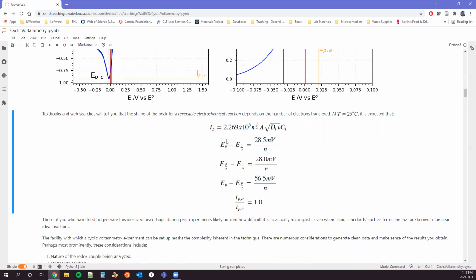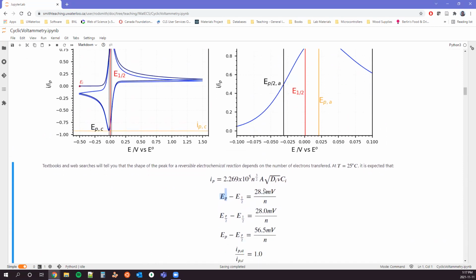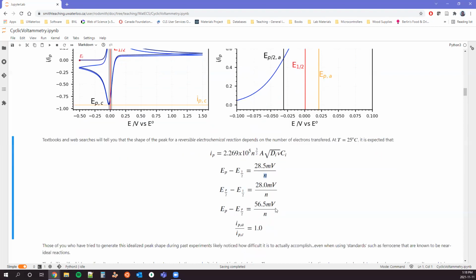And so we can use this characteristic behavior in an analytical sense like that. But more so, that nice perfect duck shape tells us what we should see here. There are all of these constants that are given to us. For example, the distance between the peak and the half wave potential, we're told, should be about 28.5 millivolts divided by the number of electrons, right? And so the greater the number of electrons, the tighter the peak gets, the narrower the full width at half max would be. We can break that up a number of different ways. We can look at the difference between the orange and the red, and the black and the orange, right? Again, all of these are different iterations on a theme. There's some shape that's given to that.